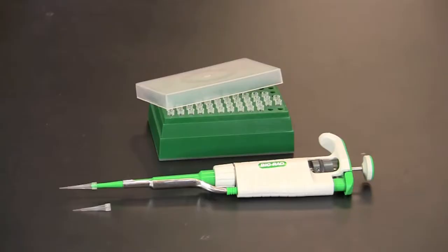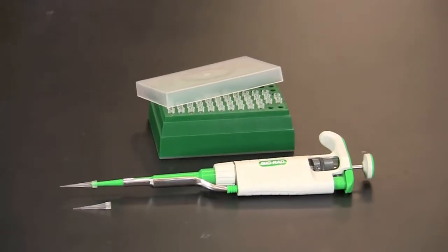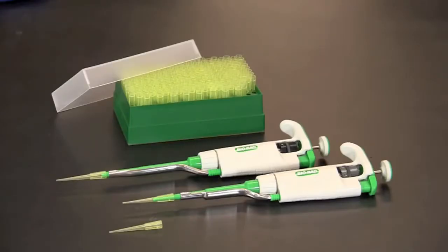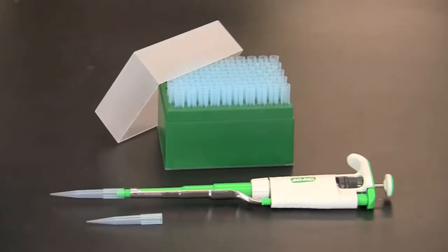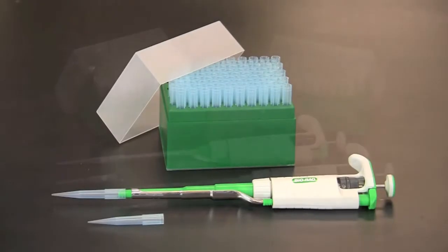The first step in using a micropipette is to make certain you are using the correct size and type of tip for the samples you will be transferring. Tips for general pipetting come in three standard sizes: the 0.5 to 10 microliter shown here, tips that fit either a 2 to 20 microliter or a 20 to 200 microliter pipette, and tips that fit 100 to 1000 microliter pipettes.